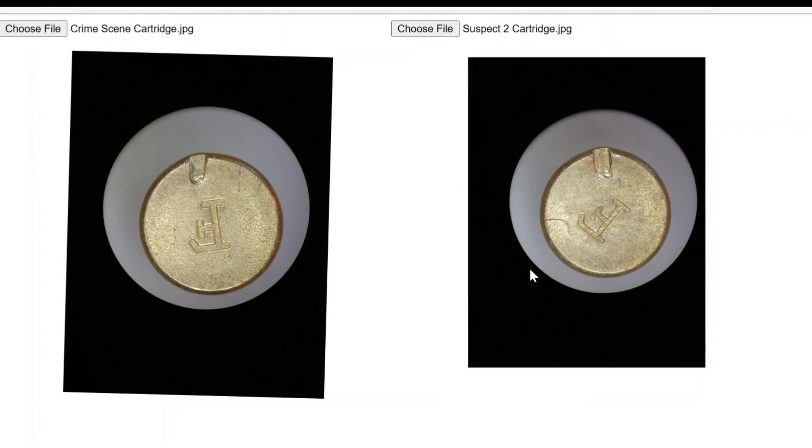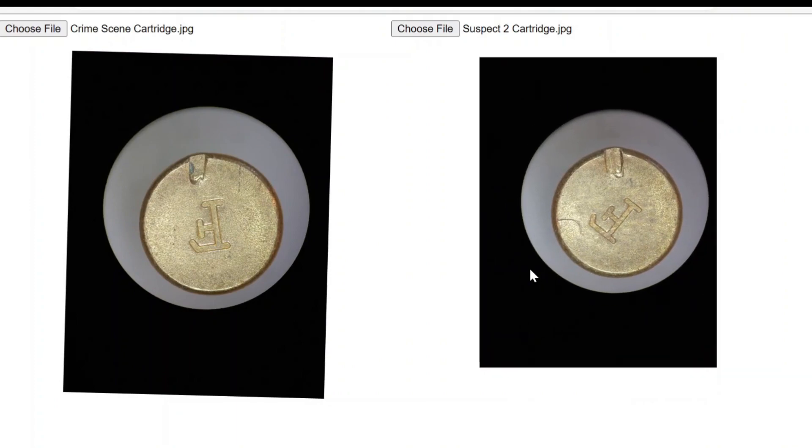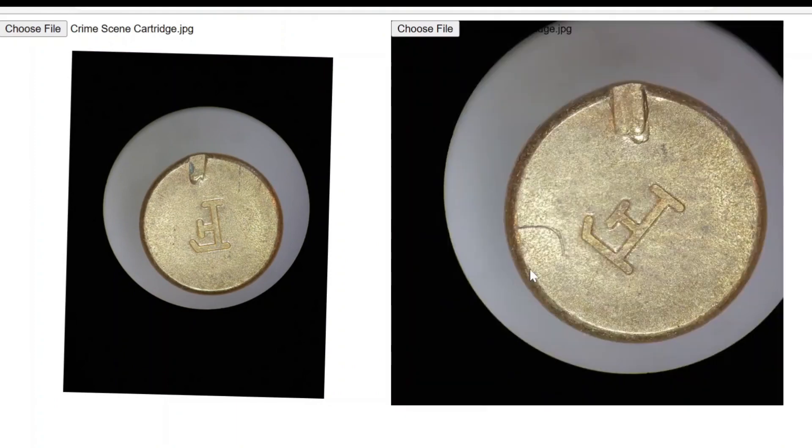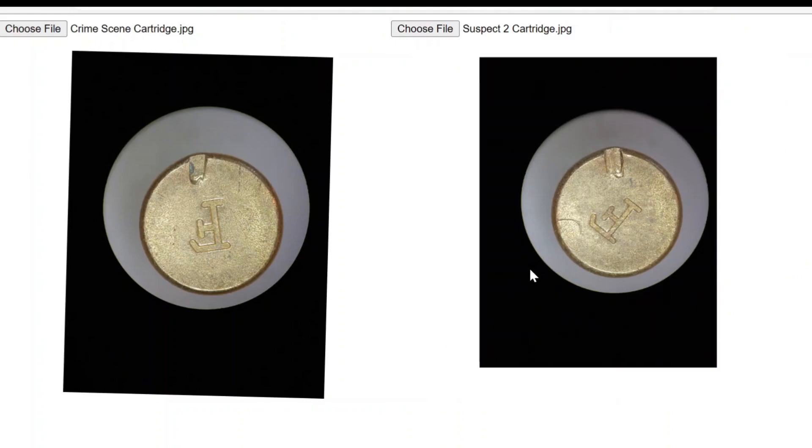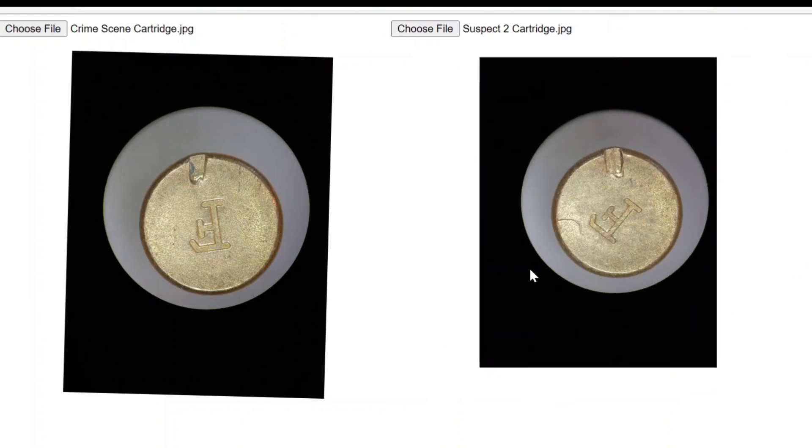I, J, K, L for the same thing on the right side. And then M for the zoom. U and O for the rotate.